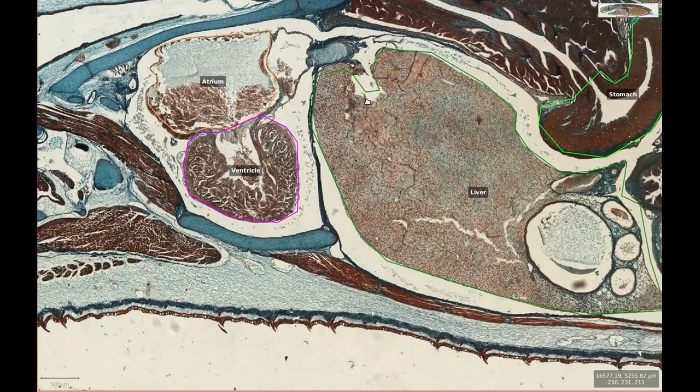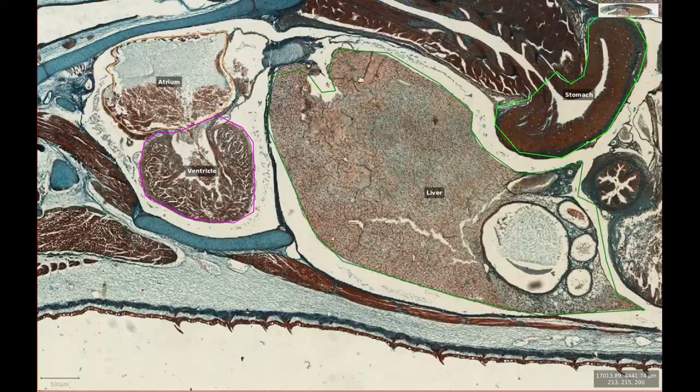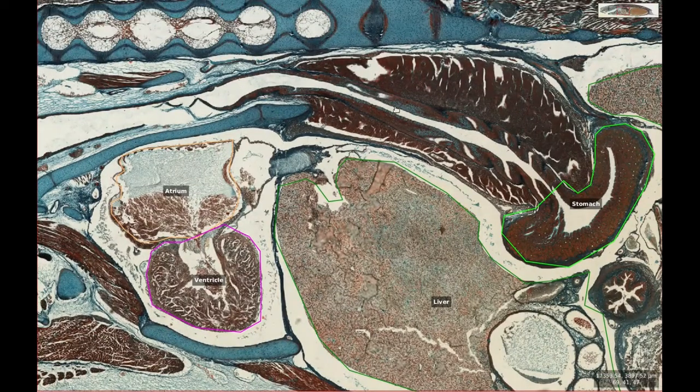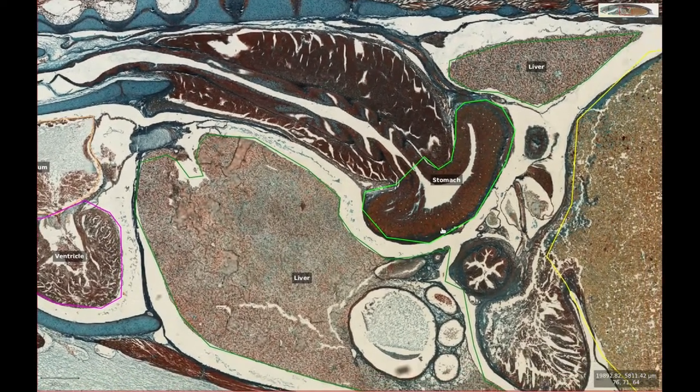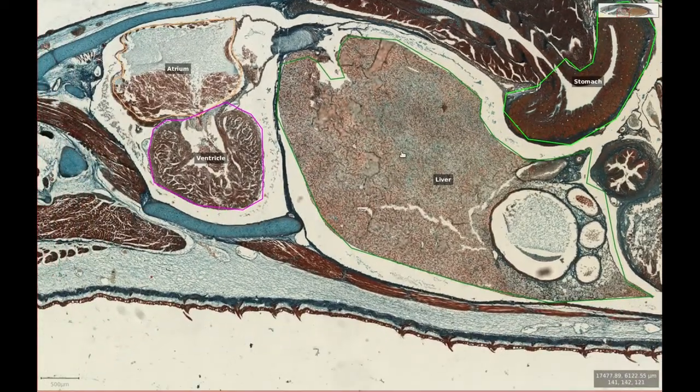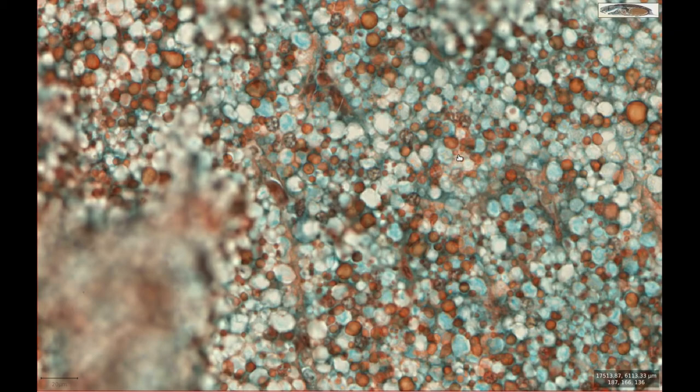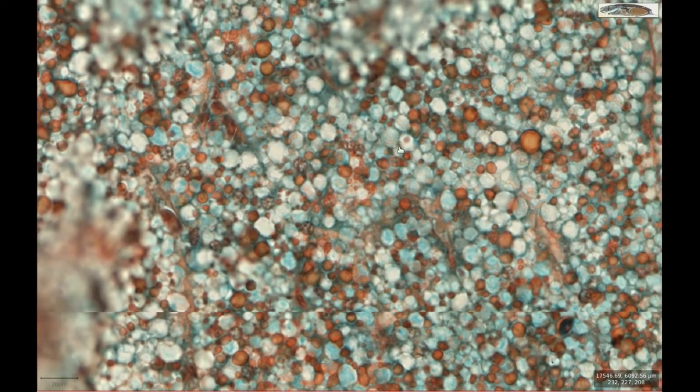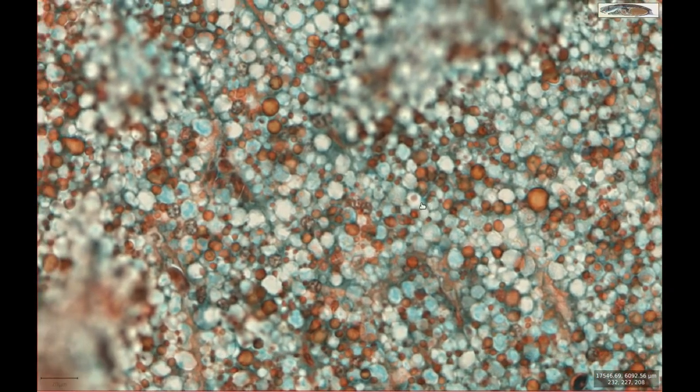Looking caudally towards the coelomic cavity, we can see the esophagus entering the stomach. Below and above the stomach are two portions of an organ composed of large cells with clear vacuoles, giving it a bubbly appearance. This is the liver. The cellular detail isn't brilliant in this section but improves in others.